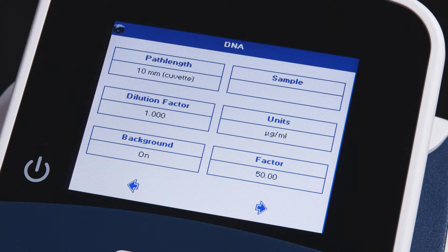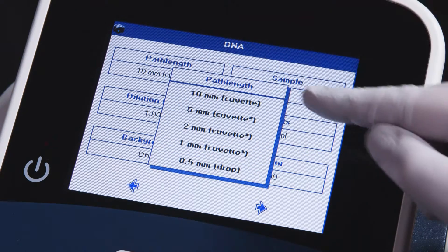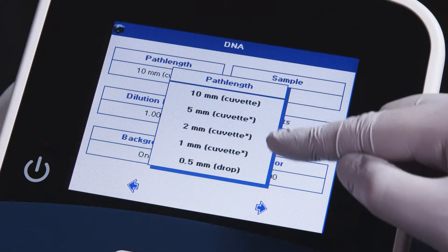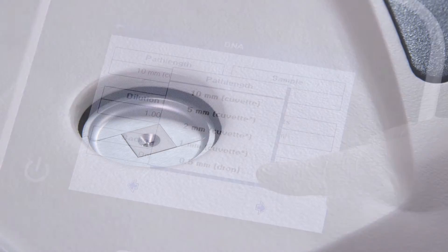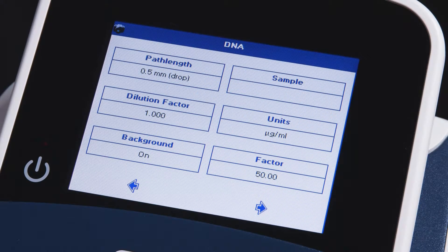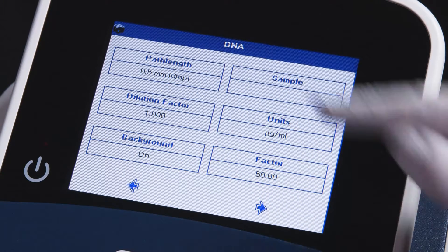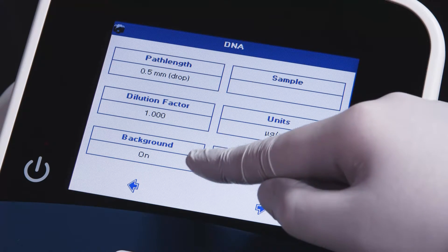Your options for DNA readings are listed here. Starting with the path length option, if you're using a standard 10mm cuvette, you can leave the setting as is. However, we'll be using the microvolume sample port, so you'll want to select the 0.5mm path length option. You may also set your dilution factor and whether or not you'd like to start with a blank measurement.